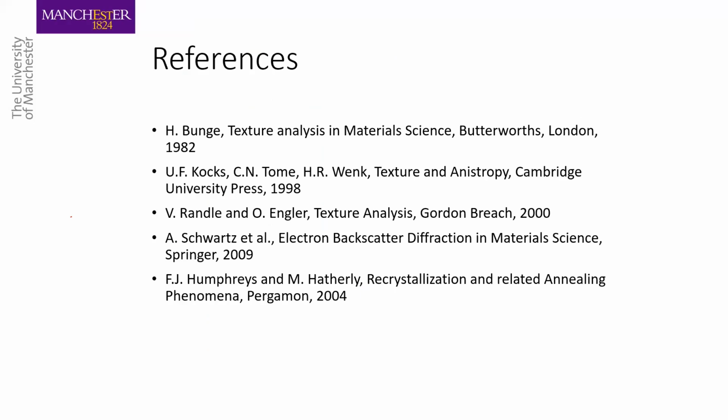There are some references that I'm going to give, for example, the Bunge book and Cox on texture analysis, and Valerie Randle's book on texture analysis. If you want to look at basics of EBSD, Schwartz's book on that, which is a compilation of papers, is a good one. And F.J. Humphreys' book on recrystallization and related phenomena is a good one for material scientists, which talks about texture.